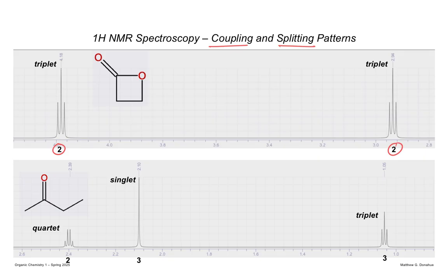But why does the triplet have these intensities? So for example, if I draw this line, then I draw that line, you could count the distance of these little rectangles going up. So if this was an intensity of 1, that would be twice the height, and then that would be 1. Where does that come from?